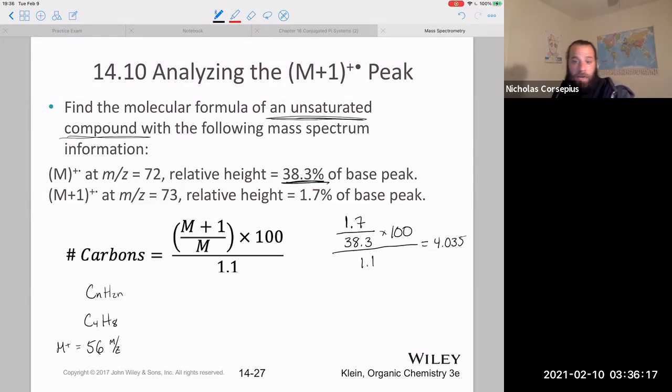However, I know that there aren't any more carbons in there. So I'm just going to play around with the other atoms. Try to throw a nitrogen in there. That would mean that the molecular formula had to be C4H9N. Actually, let's just do another one here. C4H9N.